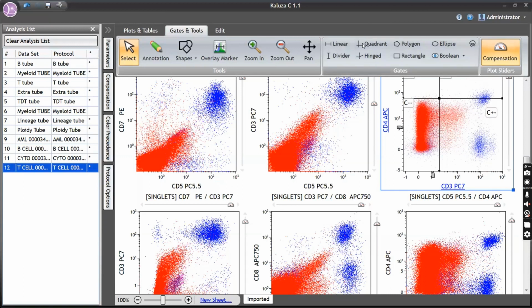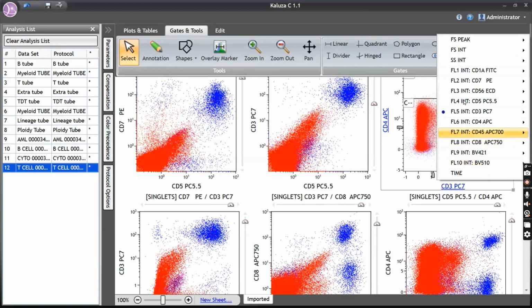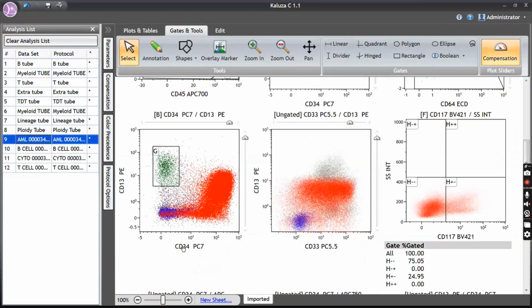Sir, I'm Dr. Shaini. Hi, sir. Here CD14 and CD64 was not that much bright. CD64 should be there. So the monocyte markers were there. Yeah, CD14 and CD64 were there, sir.